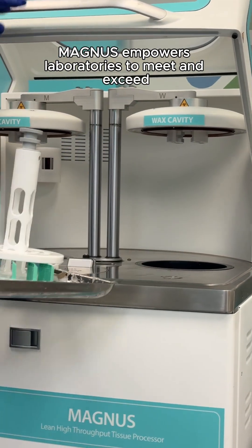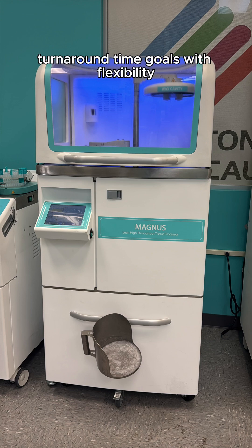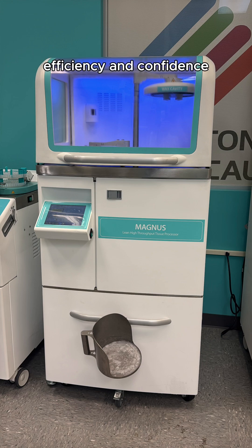Magnus empowers laboratories to meet and exceed turnaround time goals with flexibility, efficiency, and confidence.